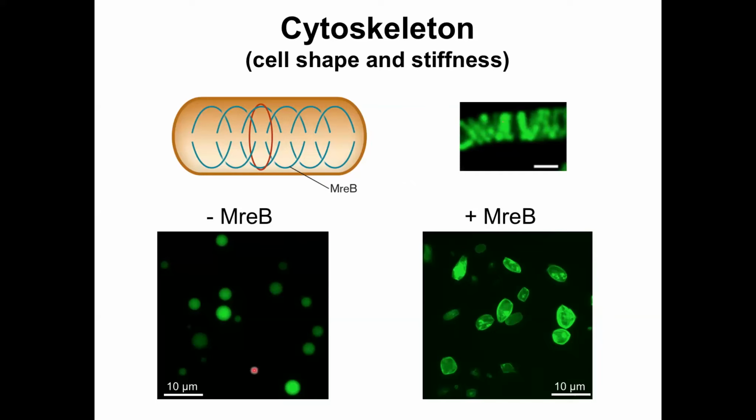So here is an image where you do cell-free expression. After a few hours, we express GFP there. And here is when you express MreB that is fused with the GFP. And if you express MreB, you're not going to see this. You need something else. So let me explain to you. I just need 2 or 3 minutes here and I'm done with the talk.